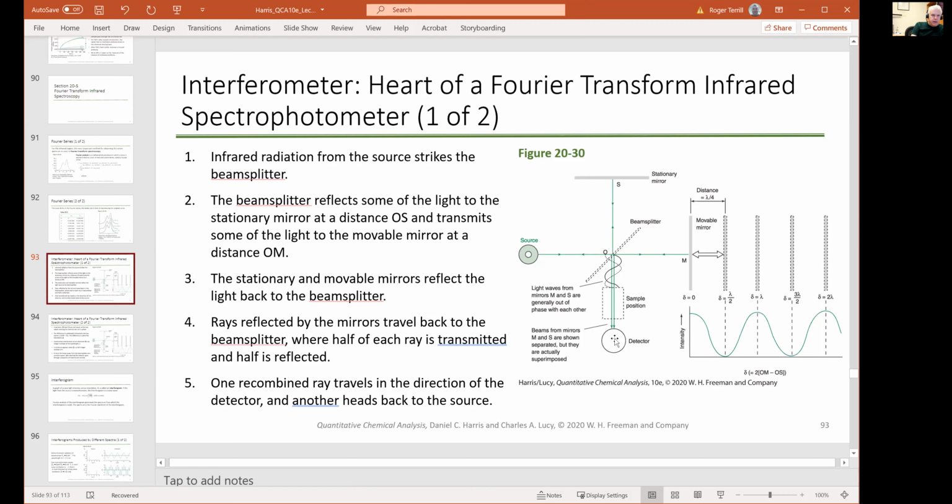Then you'll have the detector here. In each case, the detector is going to collect a modulated light spectrum. Then it will transform those into a new domain that's light intensity versus frequency, and then calculate the absorbance or the transmittance from those.